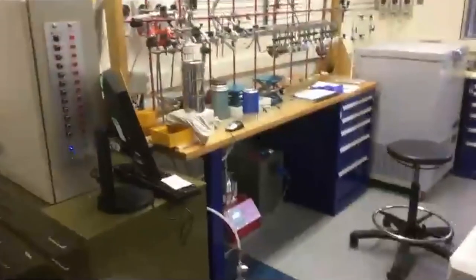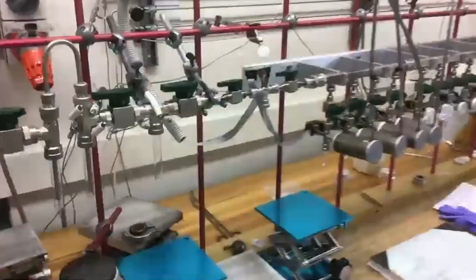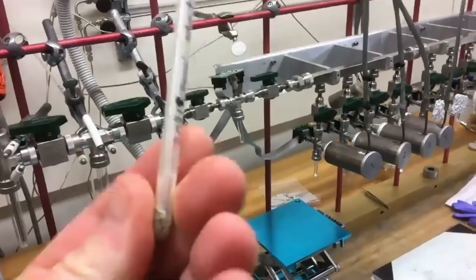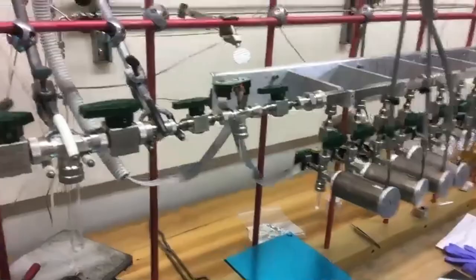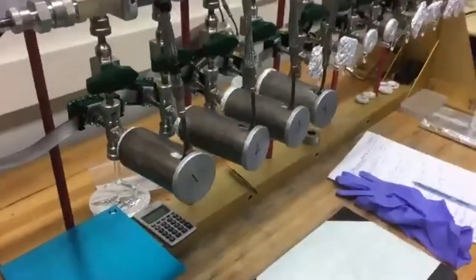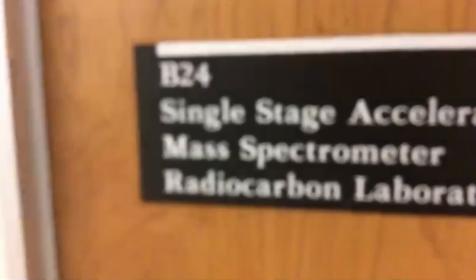Our lab starts off with a preparation area. It's a bit noisy, I'm sorry. But you can see here, this is where we prepare graphite samples. The samples are loaded into small tubes. Here are the small tubes, and you can see the sample inside. We load the samples in here, and then each sample goes into one of these reactors where we add the CO2 and the hydrogen and make the graphite. And then after it's made, we walk across to the accelerator.